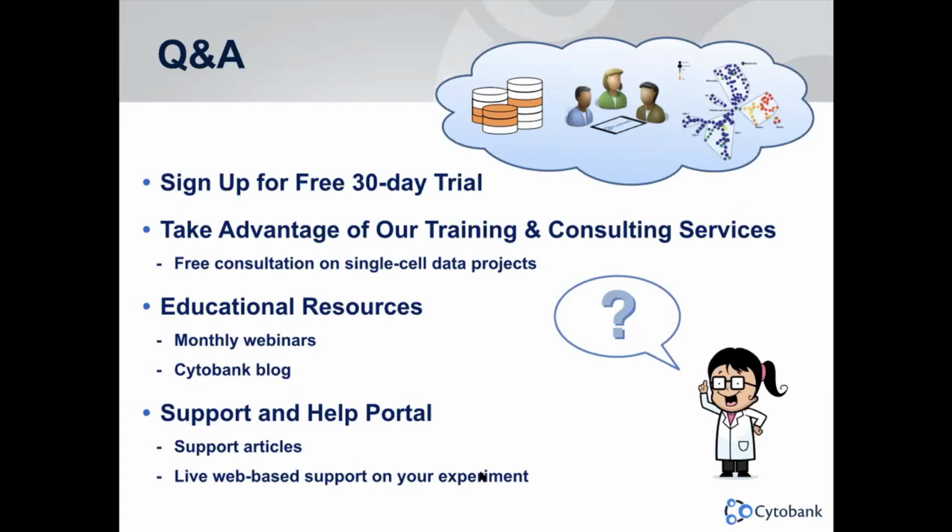Now we're going to start with our QA. I see the first question coming. It says, so in order to overlap Citrus clusters on a viSNE analysis, how is the workflow? First viSNE and then run Citrus?